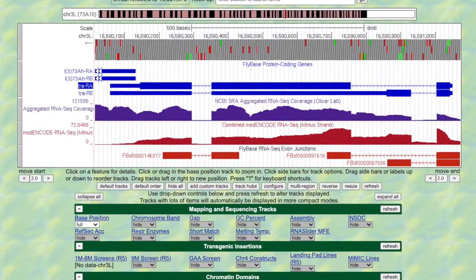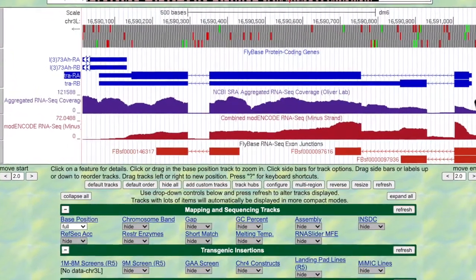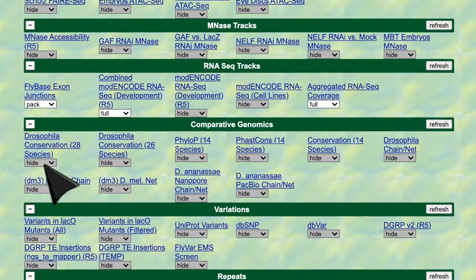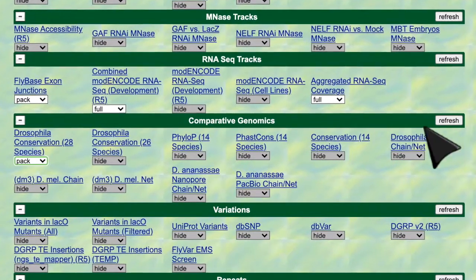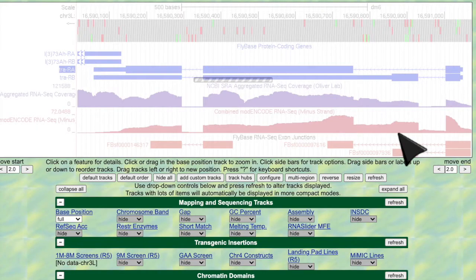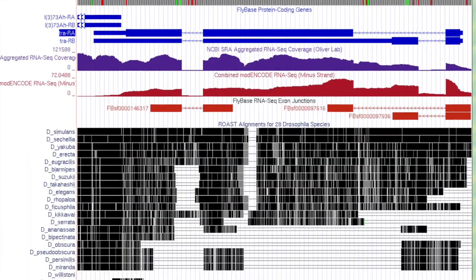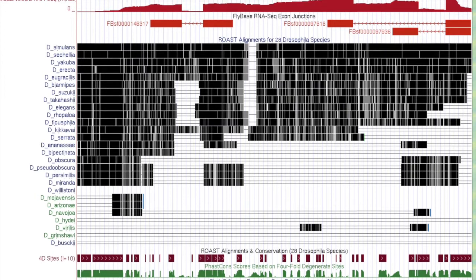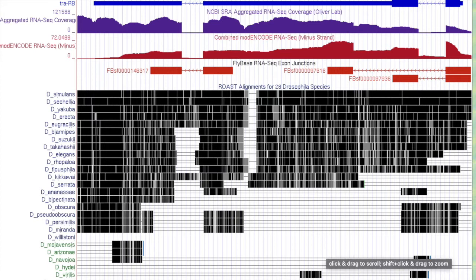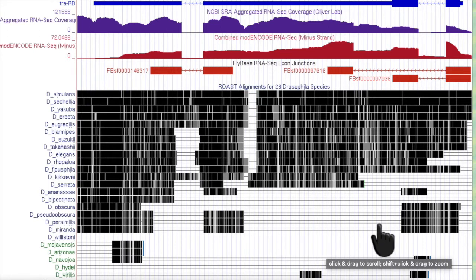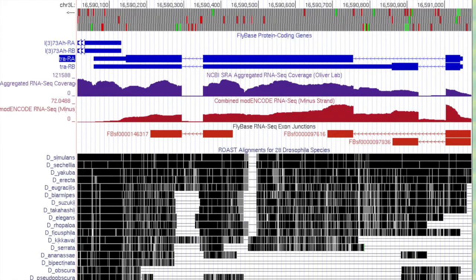With this, I would very strongly recommend also checking D. melanogaster's 28-species conservation track for conservation, because if our region of interest is well conserved, we can use Dmel's tracks as a reference to guide us in our annotation of our orthologous target gene. And if the track indicates low conservation compared to Dmel, then we can find the species that is most similarly diverged to use as our reference — with a grain of salt, as we should be doing with every track anyway.